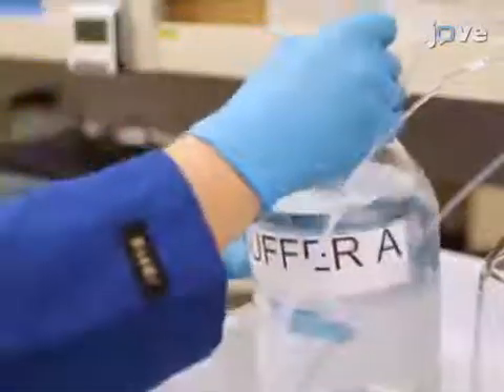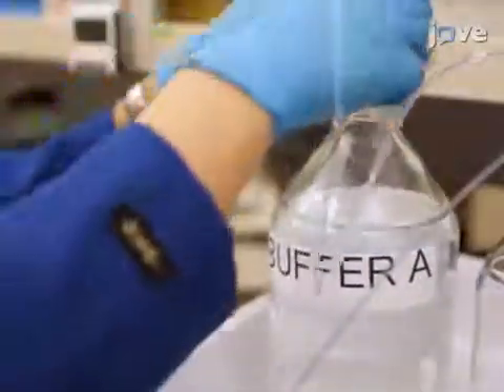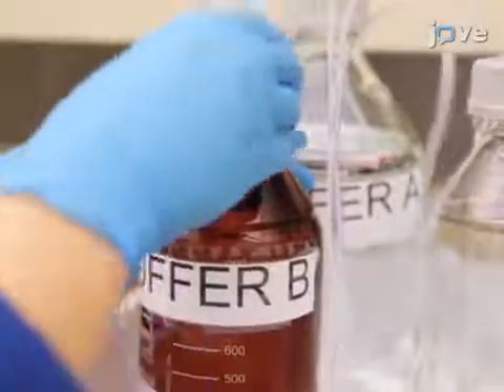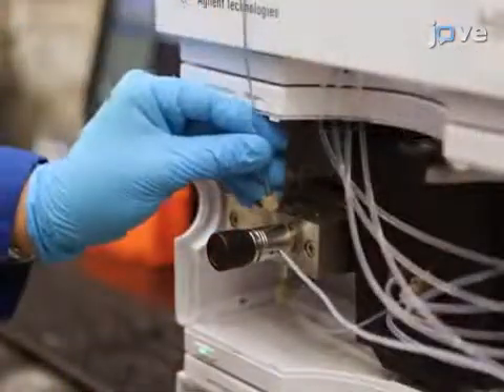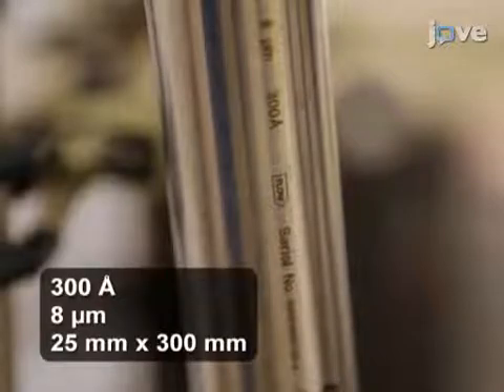To set up the HPLC, first fit the bottles of buffer A and B to the inlets of the pump. Use polymer tubing and one-piece fittings and don't mix up the valves. Connect the polymer tubing from the pump outlet to the inlet of the preparative column. Make the one-piece fitting finger-tight and make certain the column is in the correct orientation.